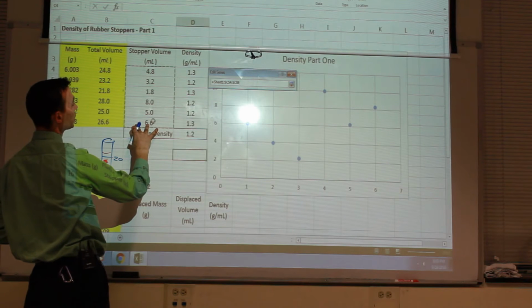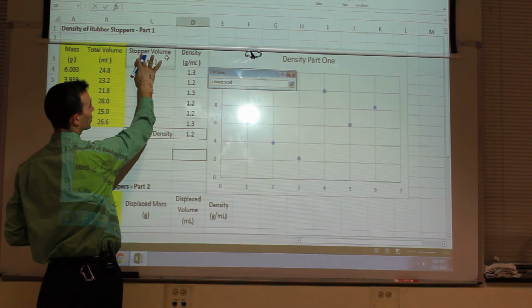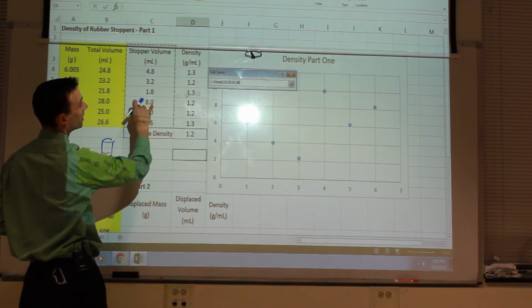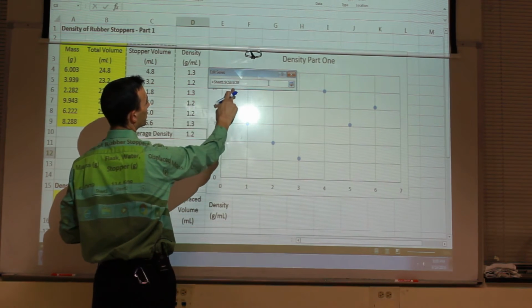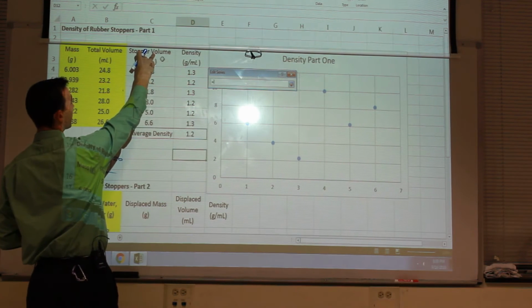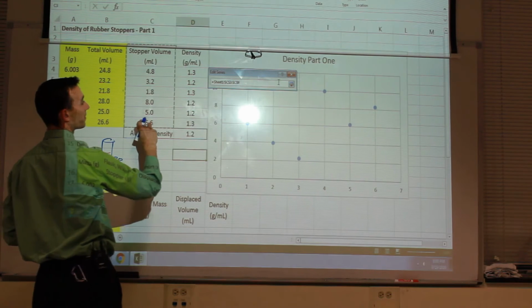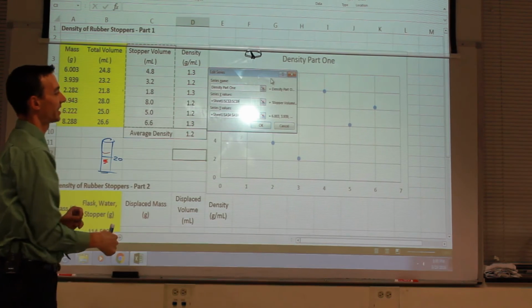Okay. Now we actually want to highlight the title in as well. I think you're going to need to delete all of that. You just sort of double did it. Just go ahead and delete all of it, and then start with the stopper volume down to the last stopper value. And then hit the little red arrow. You're ready to deposit that.